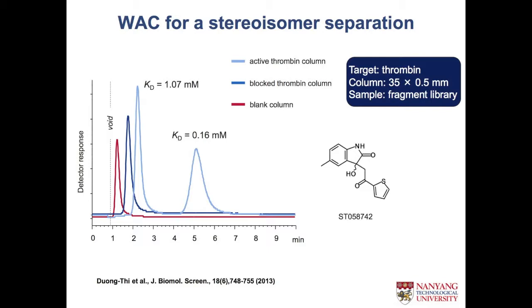And of course then we have the blank here, in this case with nothing on it. And you see that we still have binding. For me that represents binding to the surface of the protein. We have that all the time. We have a lot of interaction with the protein surface. And what does that mean? Is it relevant or not? It's up to us to decide.